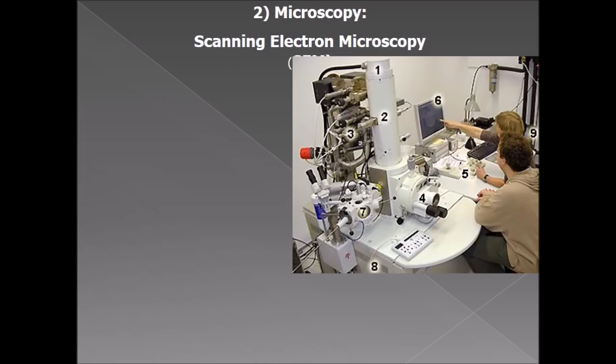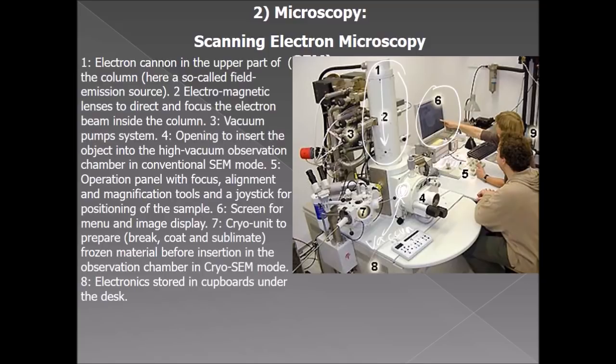In the lab, this is how an electron microscope looks like. We have a big chamber here, through which the electron beam is shot, and you have a sample in here, which is something like a microwave here, and inside is a vacuum. The signal is recorded in the computer. This is the labeling for the electron microscope, and you do not need to worry about memorizing it.